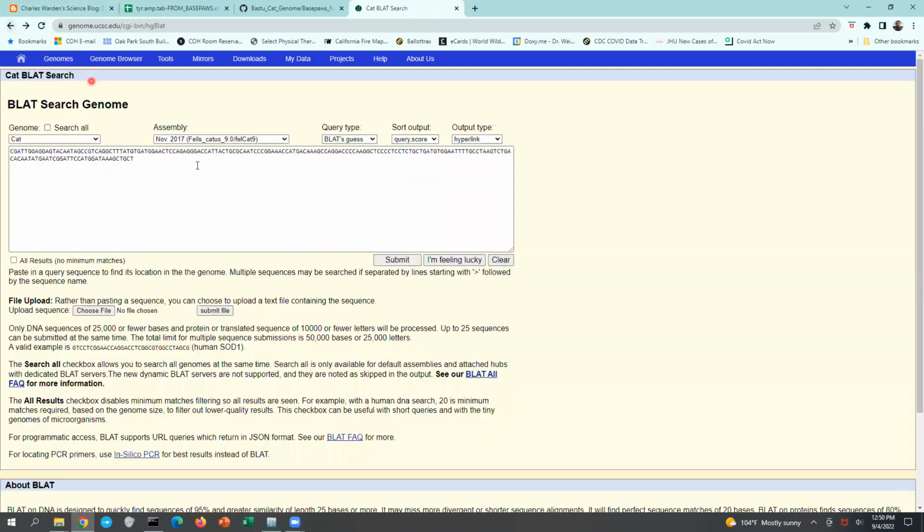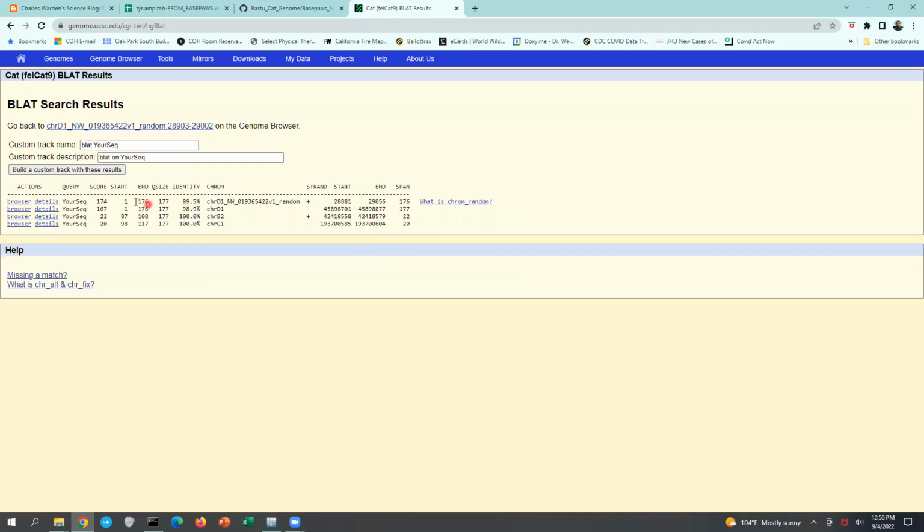However, if we're going to imagine some theoretical cat where maybe there was some complication or something, so Basepaws is willing to do this for some different customer, I'm going to manually change a nucleotide. I'm pretty sure this is not the nucleotide where I want to look, but it says 176, and now it's not 100% identical. But that doesn't mean your theoretical cat has 2 copies of the variant of interest. The reason I selected this is so that you can visually look into this to try to figure out whether your cat has 0 copies or 2 copies.